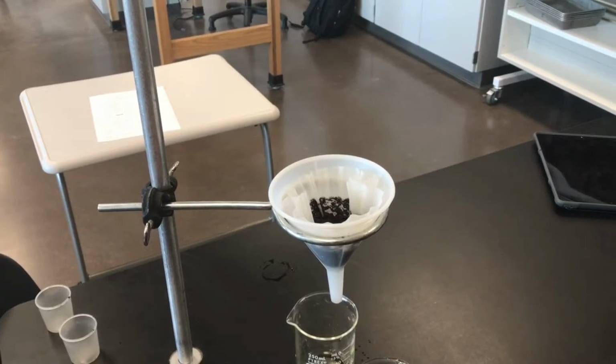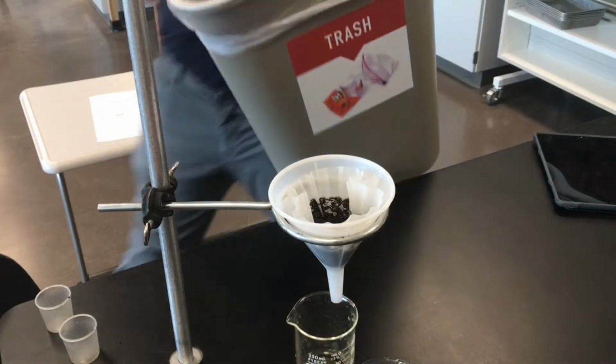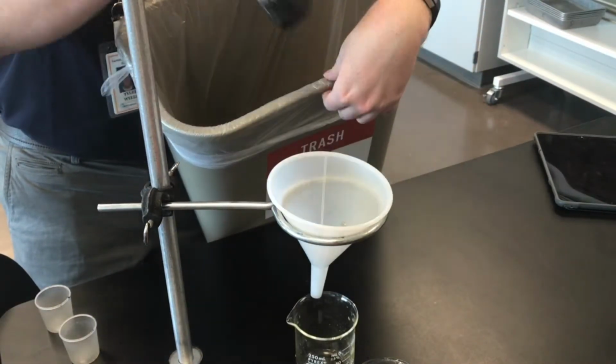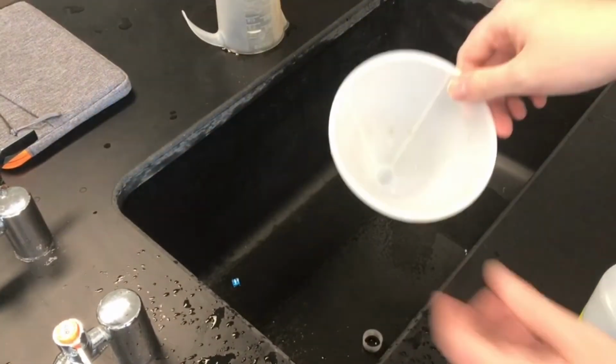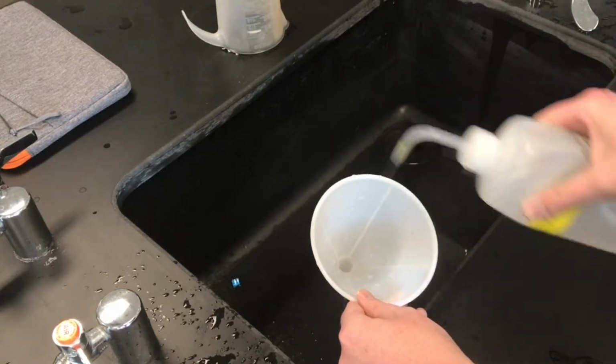Before we start the next part, you should fully dispose of everything that you'd use for part 1. So what I'm going to do here is throw away my solution. I'm actually going to bring over the garbage, and I recommend that you do this as well. To throw away my coffee filter, your funnel. We're going to rinse this out with deionized water here. So make sure you fully rinse out your funnel before you start the next procedure.